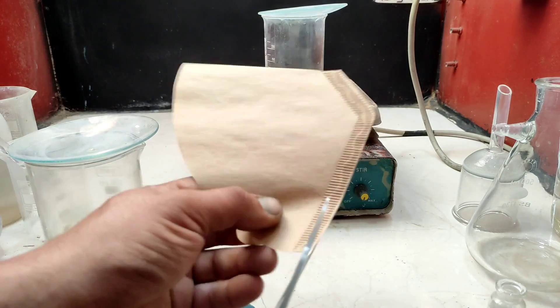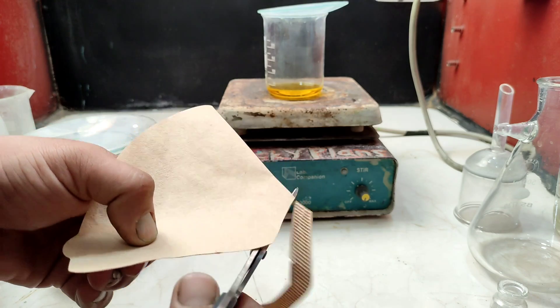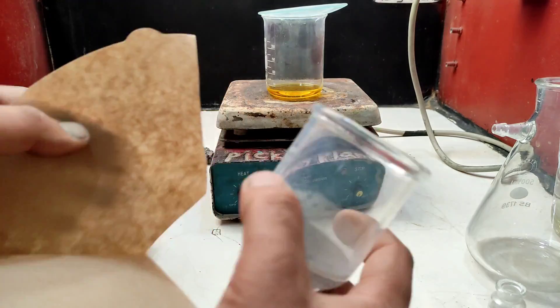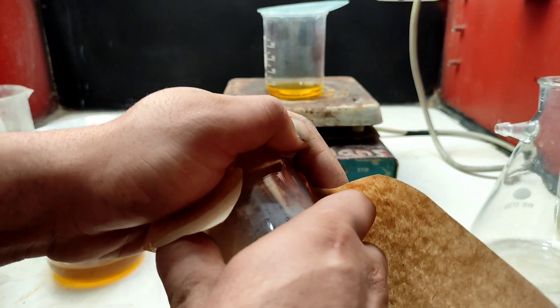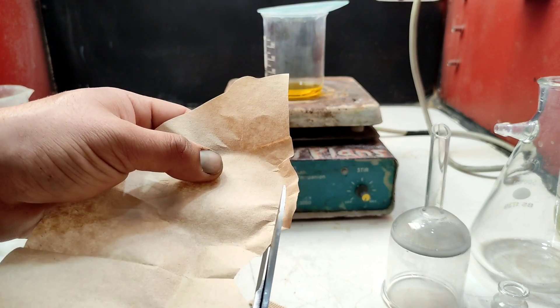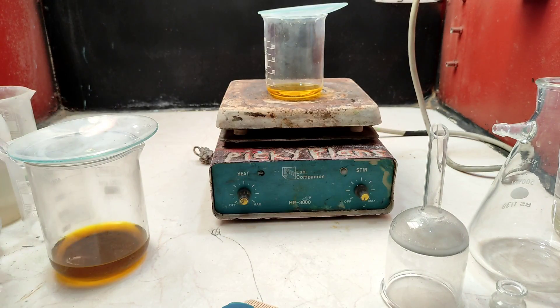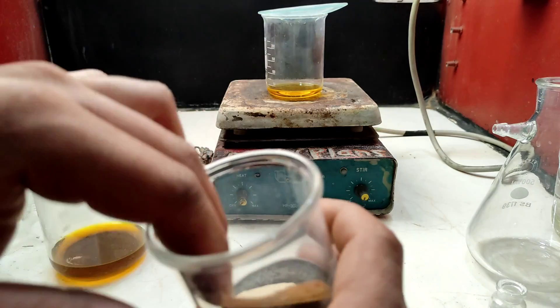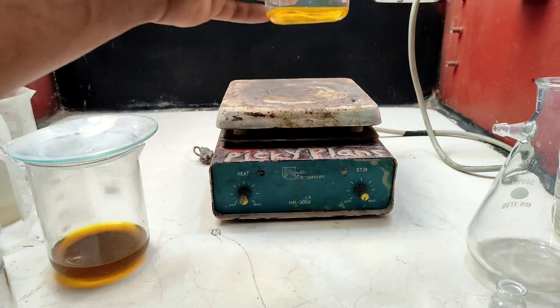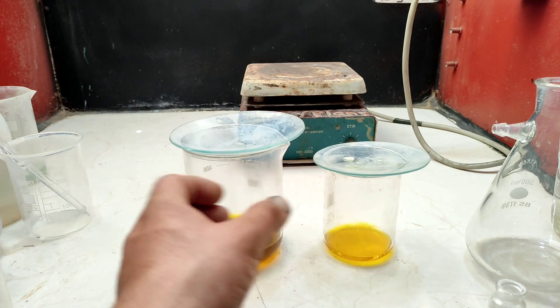Here is the way I filter the solution to clean it. First I cut a coffee filter — I need one side of the filter paper. I use a sintered glass panel, measure the dimensions, and cut the circle to fit.